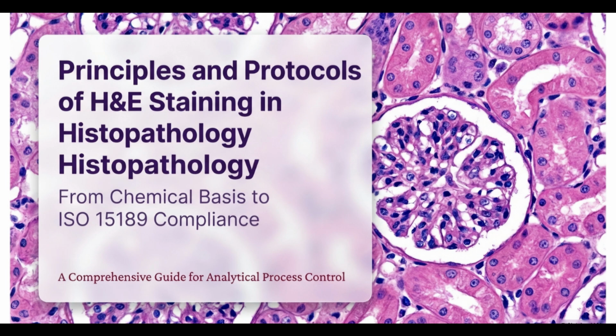All right, today we're diving into what might just be the single most important staining technique in all of medicine, hematoxylin and eosin, or as you know it, H&E. It's the absolute bedrock of histopathology. That's the study of disease in our tissues. We're about to see how this incredible mix of chemistry and precision can take a colorless, nearly invisible piece of tissue and turn it into this vibrant, detailed map that's packed with diagnostic information.